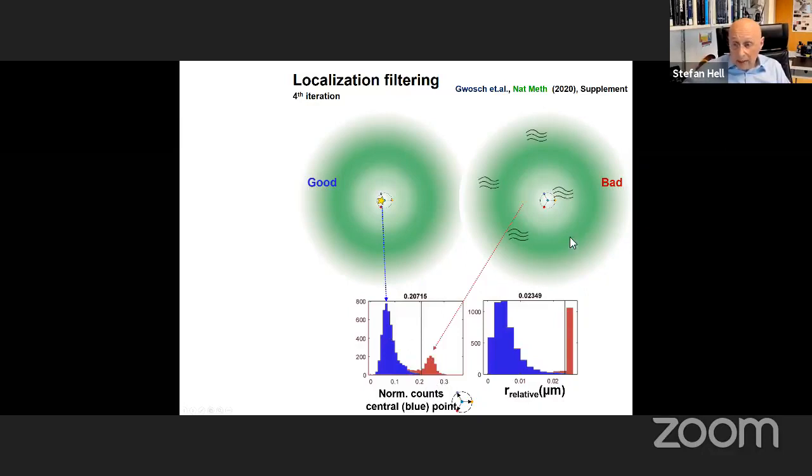And of course, I would like to mention, this is also important. In this case where you have equal brightnesses for all measurement points, it could also be noise. It doesn't mean that we discarded a molecule in here. It could be due to noise, because this kind of way of iterating tries to catch something, and then of course you may be catching noise, so to speak. And this doesn't mean that molecules were discarded.